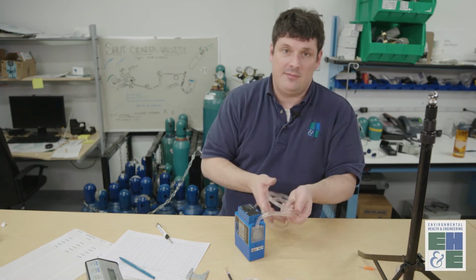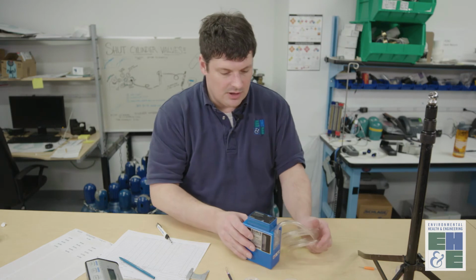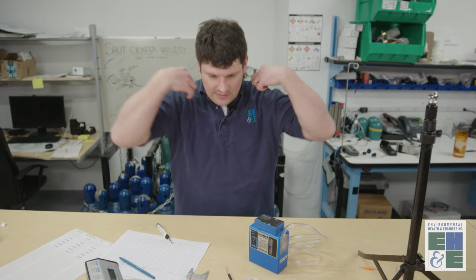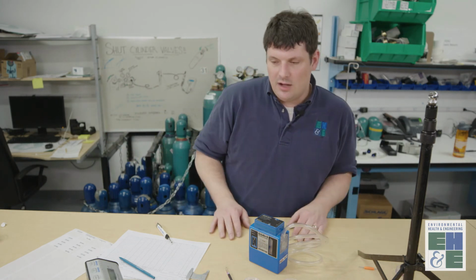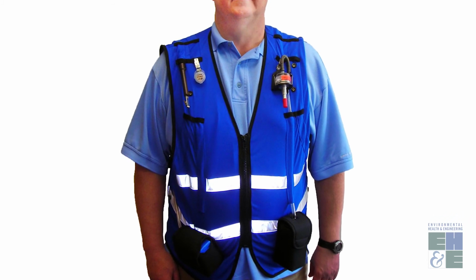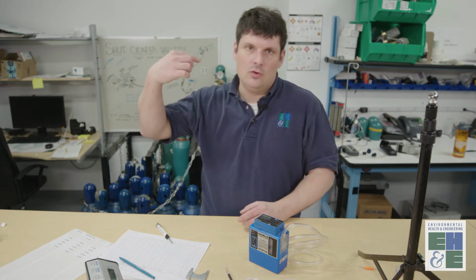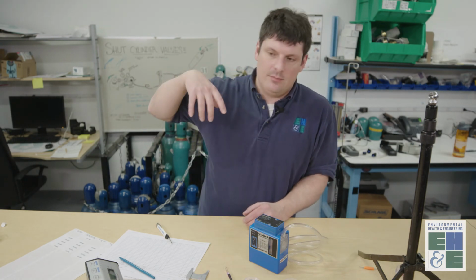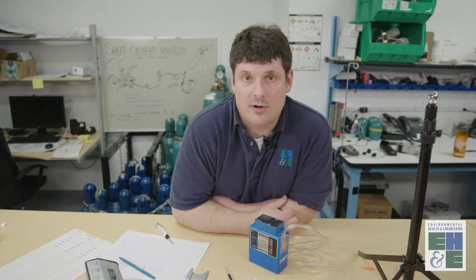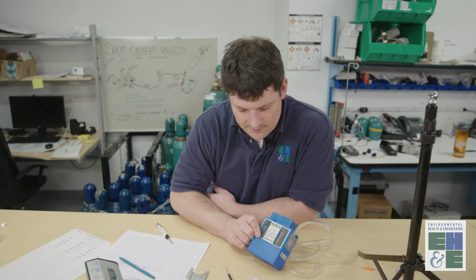Sometimes we have multiple types of samples that we need to collect at the same time with multiple pumps. So we have to use either a backpack that can hold the pumps with tubing that comes up to the breathing zone. We also have special vests that hold multiple pumps that workers can wear. We've also done personal samples with a long tube connected to people so they can move about a small area and yet still collect a personal sample. So that is area sampling using the GilAir 5 personal air sampler.